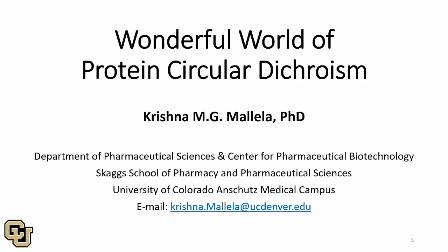Thanks, Keith, for the introduction, and also Applied Photophysics for inviting me to present this inaugural webinar. This webinar will be followed by several other webinars from both academic scientists as well as formulation scientists from industry. We'll be particularly talking about circular dichroism of proteins. Before going into real examples, because I wanted to show 5 case studies of how we used circular dichroism to determine how proteins behave, we'll go through some initial introductory slides about circular dichroism.